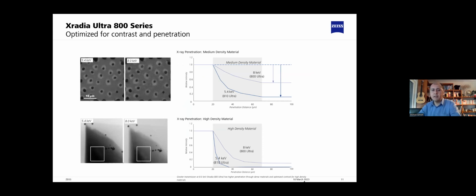Talking a bit about the available sources and energies, as I said, the chromium K-alpha line offers 5.4, and copper K-alpha offers 8.0 kilo electron volts. Depending on the type of material, from middle to low-Z material, it is recommended to go for the chromium source due to the lower energy, because of the nicer contrast. For low-Z materials, even if we go for a higher energy source, the absorption will be limited across the sample. So we have to wait longer to compensate for the noise, while with the lower energy source there will be a nice delta in terms of absorption of X-ray photons, which leads to better image quality and a nice contrast. On the other hand, for a higher density material, it is recommended to go for the source with the higher energy, so that at the end there is a good combination of signal to noise ratio as well as contrast in the image.